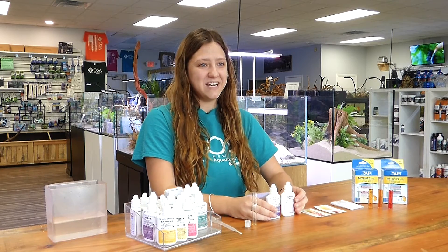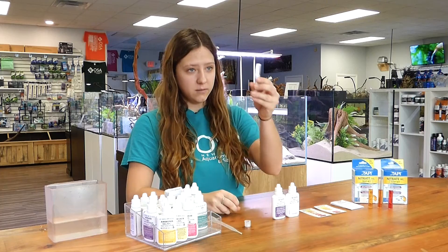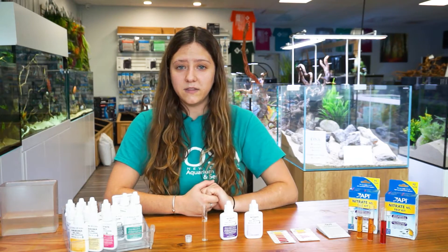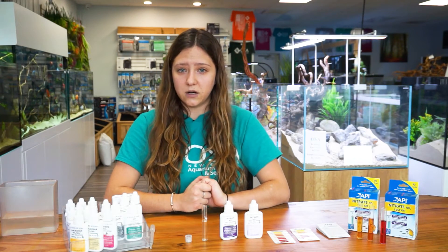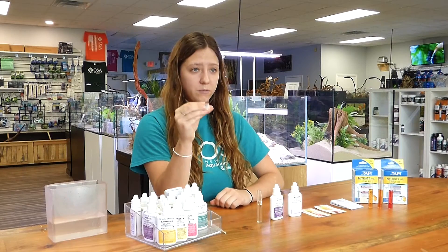The API nitrate test kit comes with two bottles: bottle number one and bottle number two. It also comes with the five milliliter test tube and a cap. Before we begin, I'd like to let you know that bottle number one in the nitrate test kit is a very strong corrosive, so you want to be very careful when performing this test. You want to make sure you don't get it on your skin, and you want to make sure that you do use the cap when performing this test.